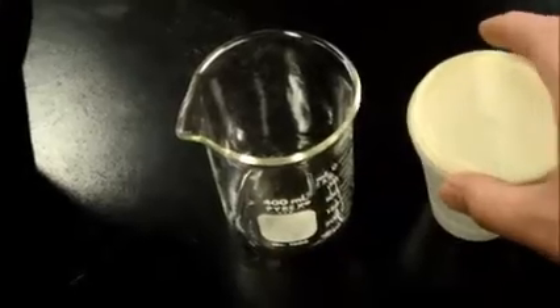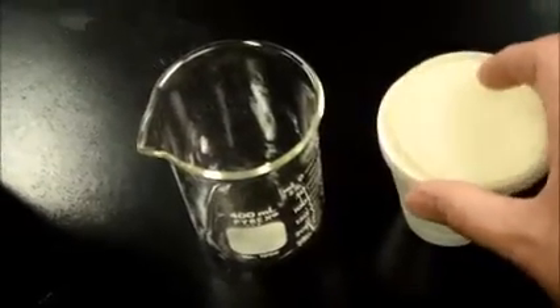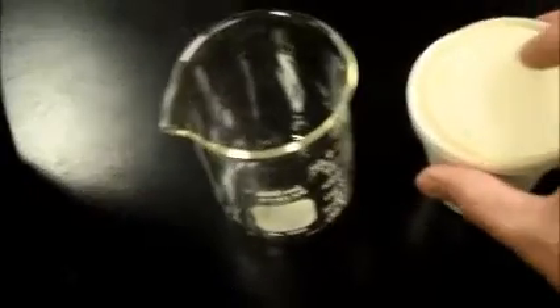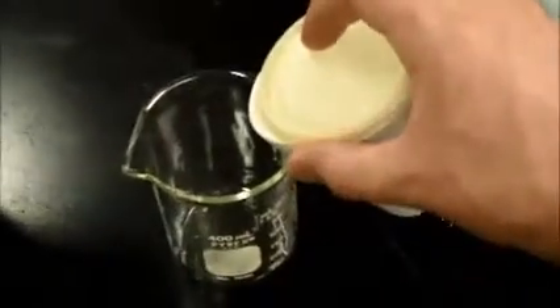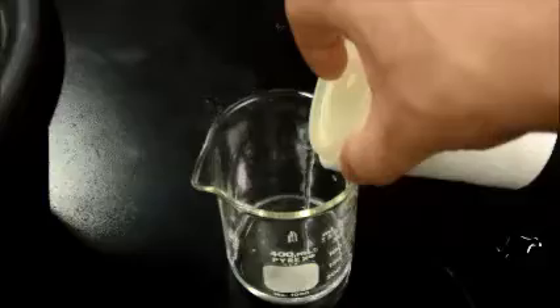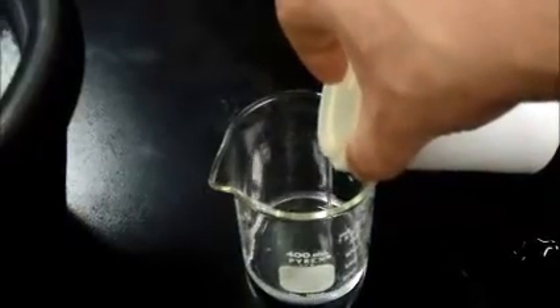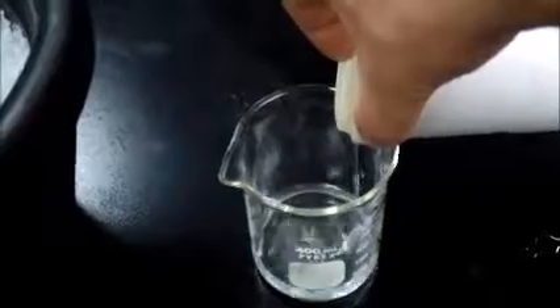The lab calls for filtration. We are going to do a decanting, which means move the lid slightly ajar so only the liquid can get out and none of the solid — the ice. And then you can carefully pour that off into a pre-weighed container, or you can wait at the end.